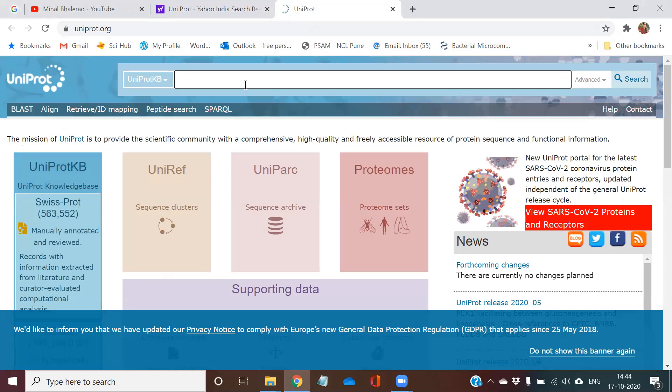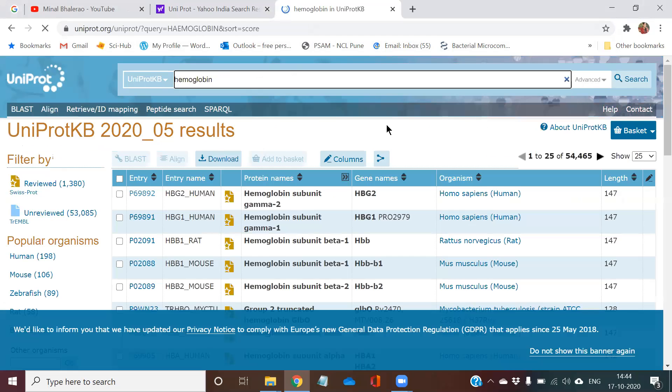Now, whichever protein you want, you can type the name in the search box. Suppose I want to study the structure of hemoglobin protein. So I am typing the name of hemoglobin and pressing enter.